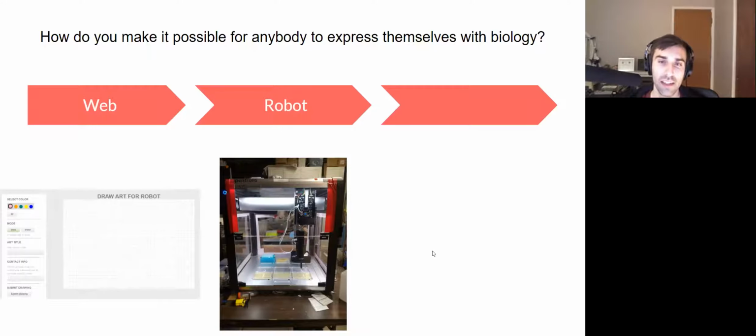Or maybe you say, man, there's no purple here. Or maybe you say, man, the teal color that CCL has really stinks. Because my nemesis is the teal colored strain because it just never produces the protein enough. And so maybe you want to think about, okay, how could I get a better teal? Or how could I get purple instead? Or something like that. Great. Now we're thinking about microbiology.